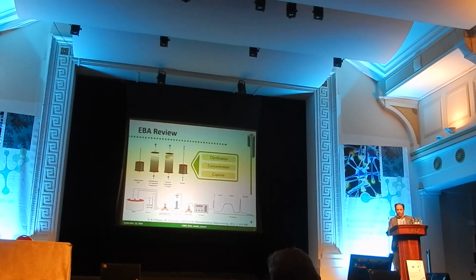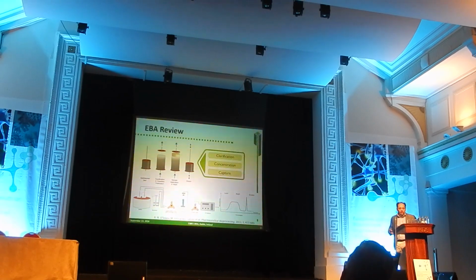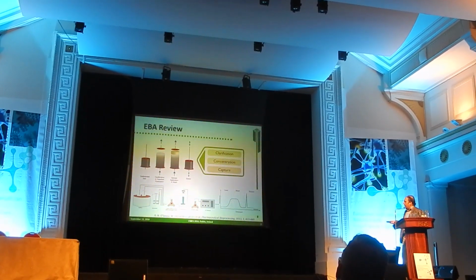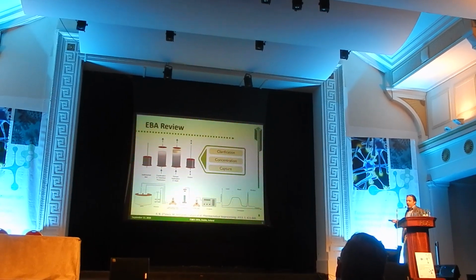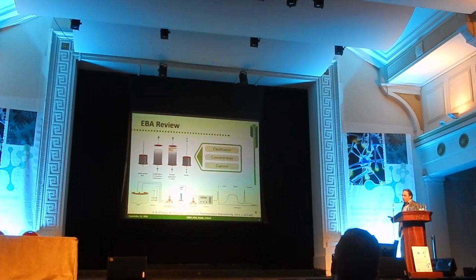The setup of this technique is also relatively common. You see some tubing, some pumps, in this case peristaltic pumps, the column itself, and the chromatographic profile.